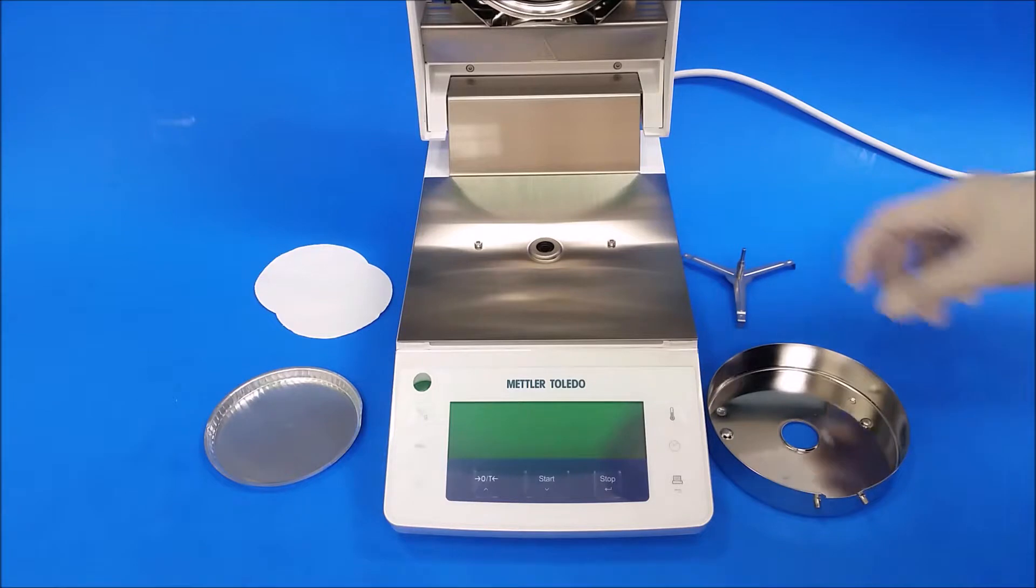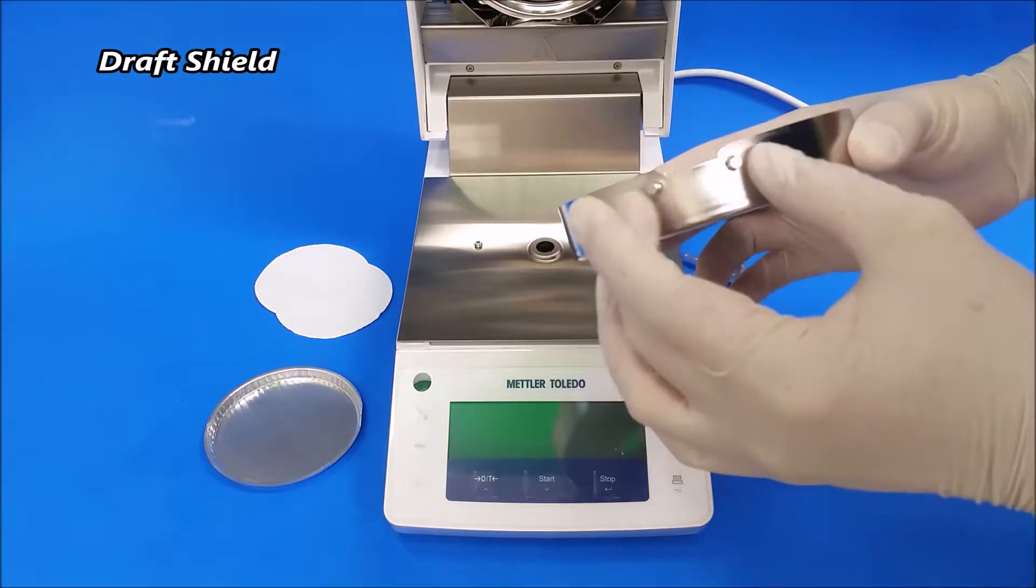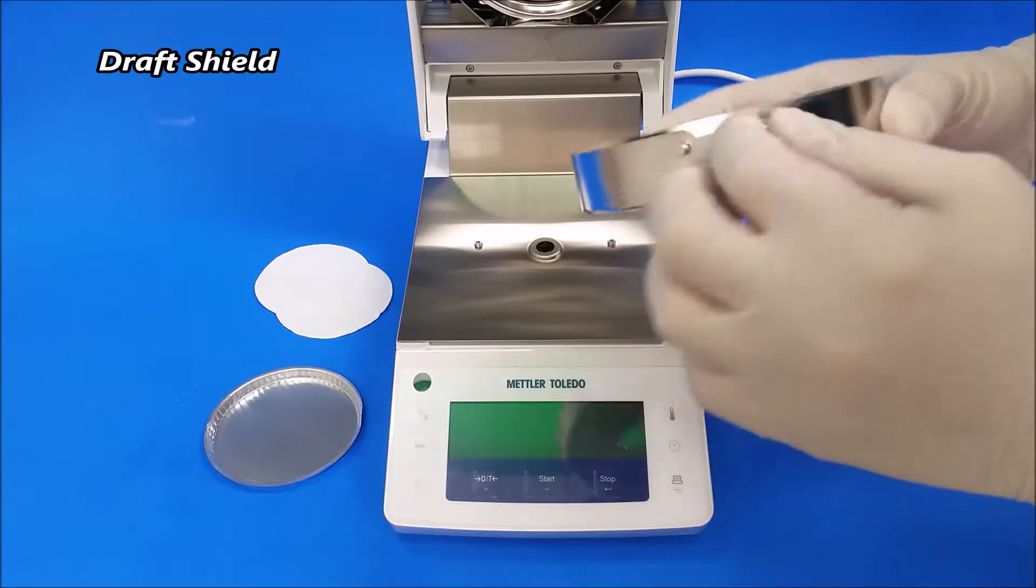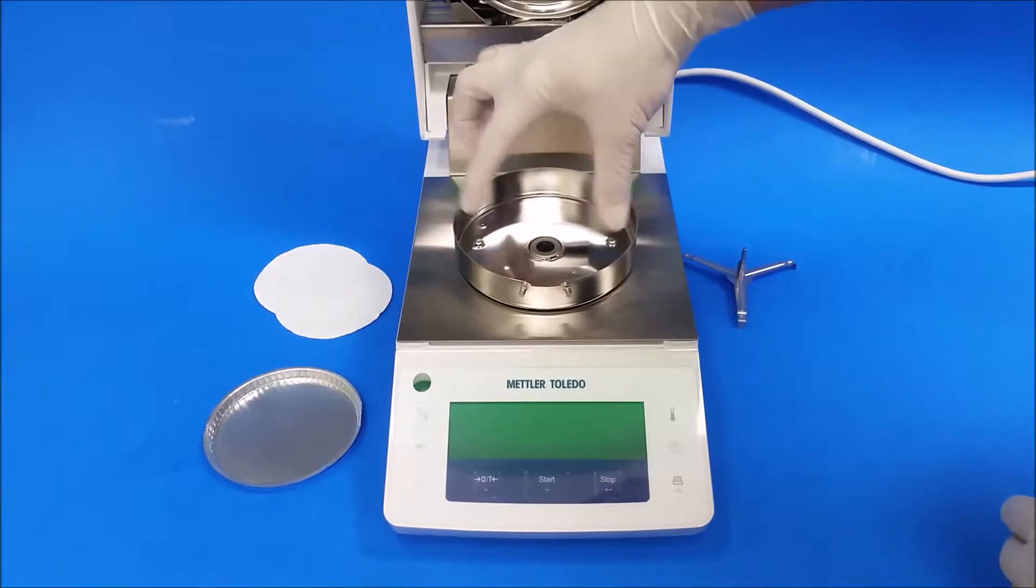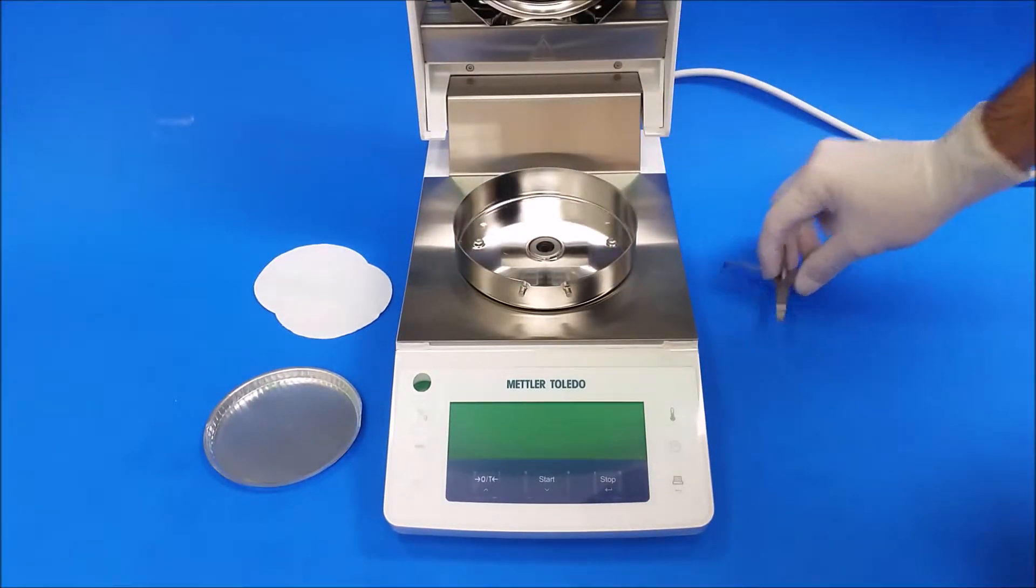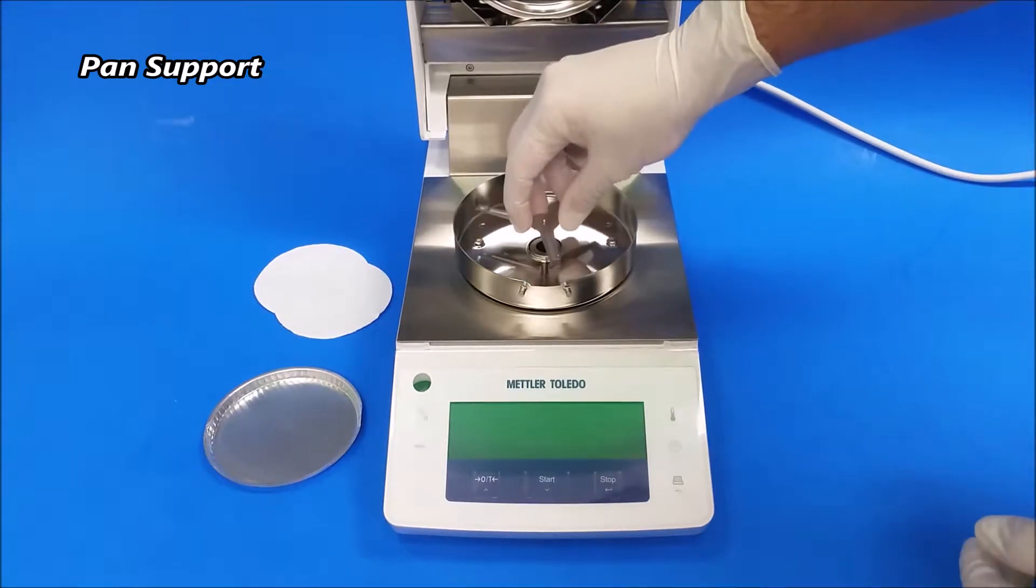First piece is the draft shield. It's going to have these little two rods stuck to each other. Make sure it's pointing towards you when you're putting it in. Align it to the two screws that are in there. Next piece is the pan support, just put it in here gently and spin until it drops.